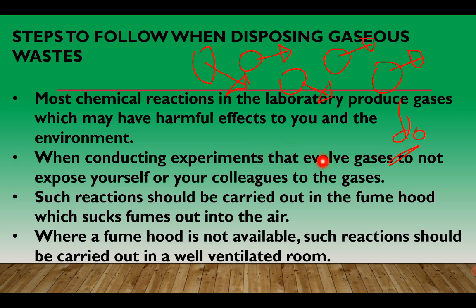Let's suppose that the reaction is taking place in a test tube. You are advised to face the test tube away from you and your colleagues. If you're working in a group, make sure that the mouth of the test tube is facing away from you and your friends. So when conducting experiments that produce gases, do not expose yourself or your colleagues to the gases.